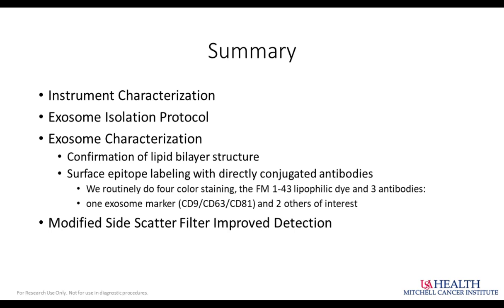There are many, many references on how to properly do titration of antibody out there. Just search the web, and I'm sure you can find 4 or 5. But it's very important to try titration with all of these epitopes, especially in our case where we were trying to minimize the amount of antibody to get a signal in this no-wash particle. So we found that to be very, very critical. You can't just go adding a whole bunch of antibody in there and not wash it back out.